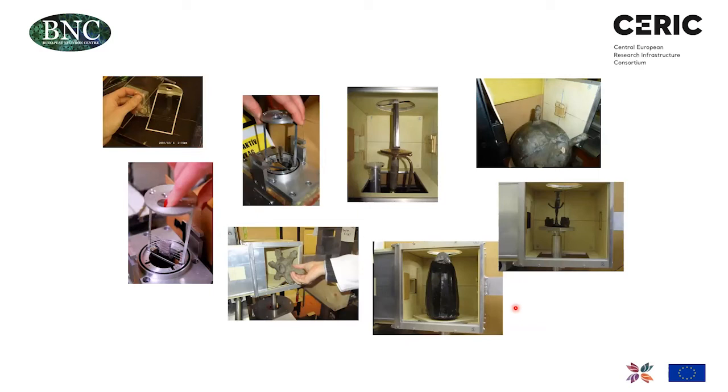So some more samples. Please note that for these excessively large samples, we can dismount the sample chamber, so we can accommodate even very large and very bulky samples. And this is also a quite large one, weighing about 5 kilograms. These are bronze objects here. This is a sword, which can be scanned from up and down. And say the welding, for instance.